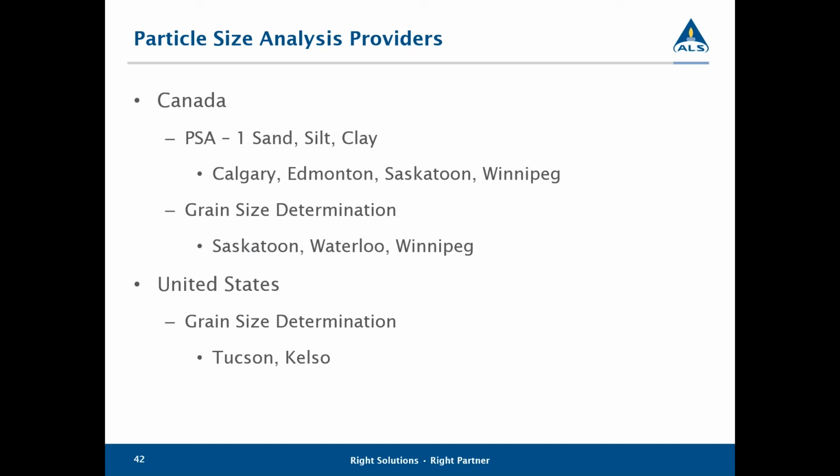In the United States, we do have grain size determinations following ASTM D422, which is similar to ASTM D6913 and ASTM D7928. We just haven't moved over to those standards because they're not requested often. Both our Tucson and Kelso labs offer those.